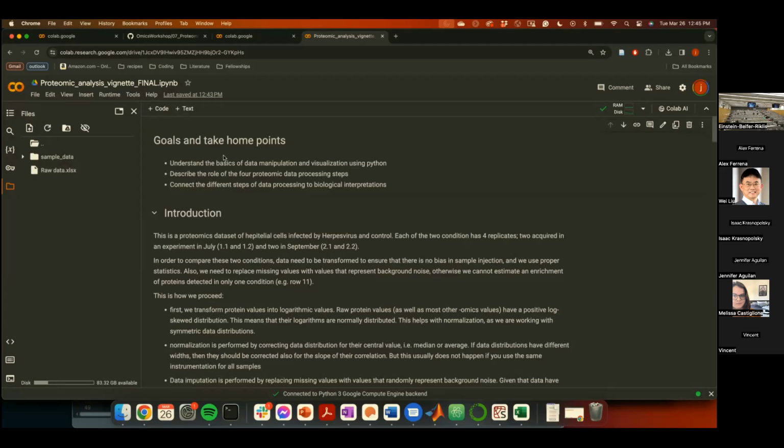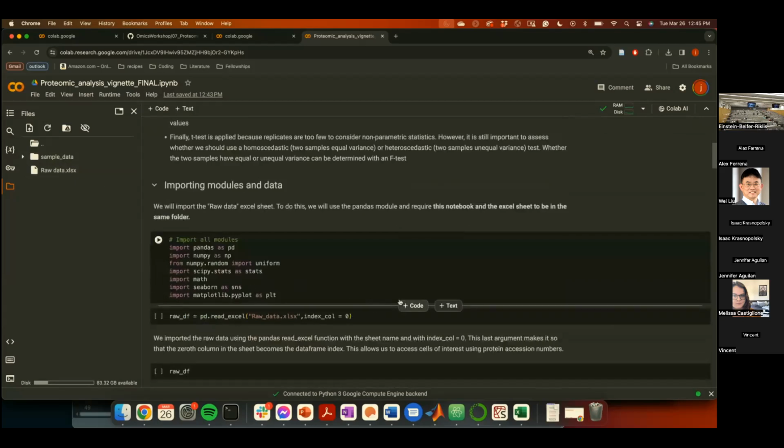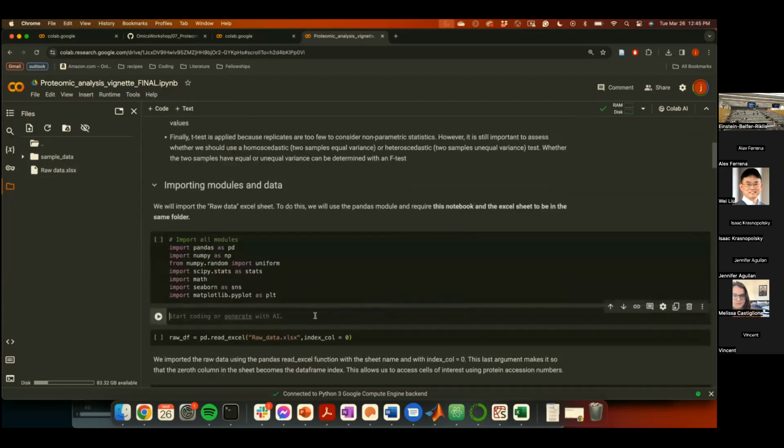Okay, so we have uploaded the data, and one neat thing about these Google Colab notebooks is that if you're familiar with Bash, you can run some of those Bash commands. If I want to make sure that the file I want is present in my current directory, I can type ls, which stands for list.